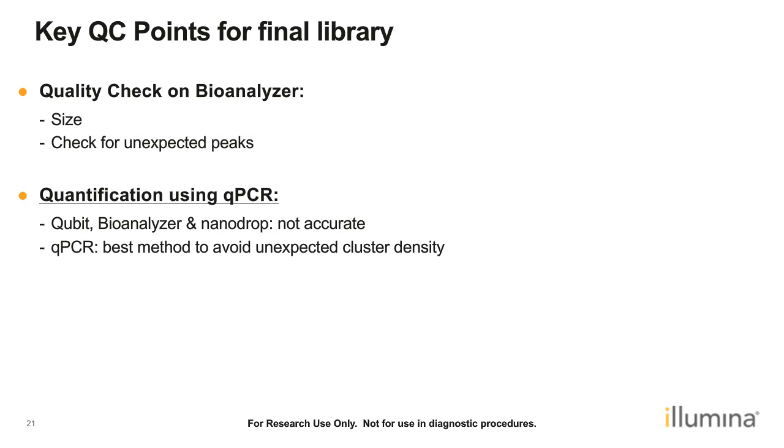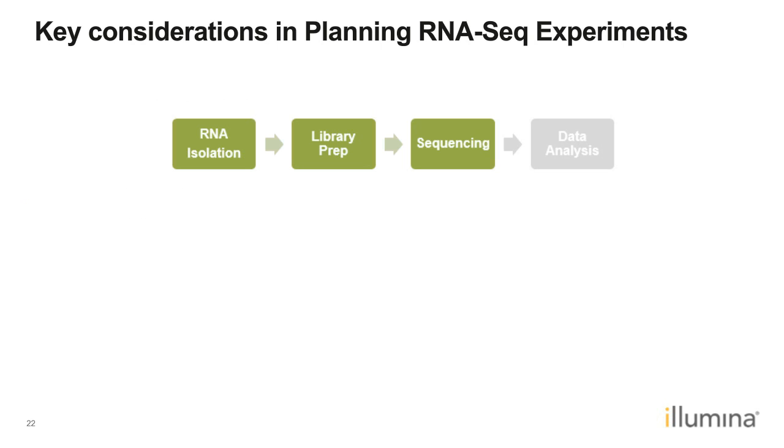If you want to learn more about best practices for RNA library preps, please tune into part 2 of this webinar series, which focuses specifically on best practices. So now that we've QC'd our library, we'll run it on the BA bioanalyzer. And if it looks good, we're going to move on over to sequencing.